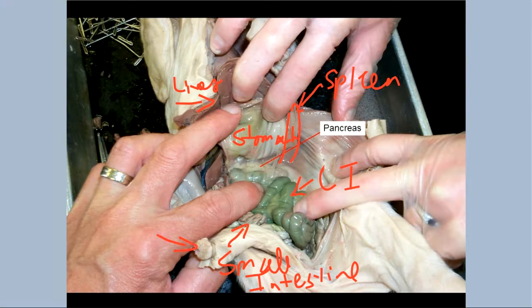This is the umbilical cord. This is a male. Note the genital opening there. So this thing is the penis there. Okay, and I'll draw it in blue maybe. This diffuse structure, that's your pancreas. And there's a little piece there also. That's your pancreas.